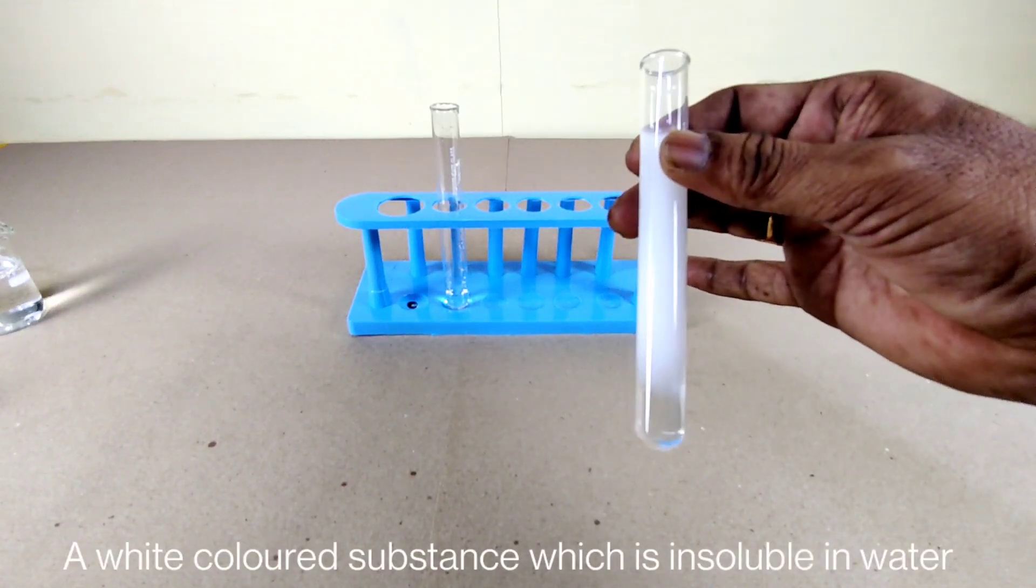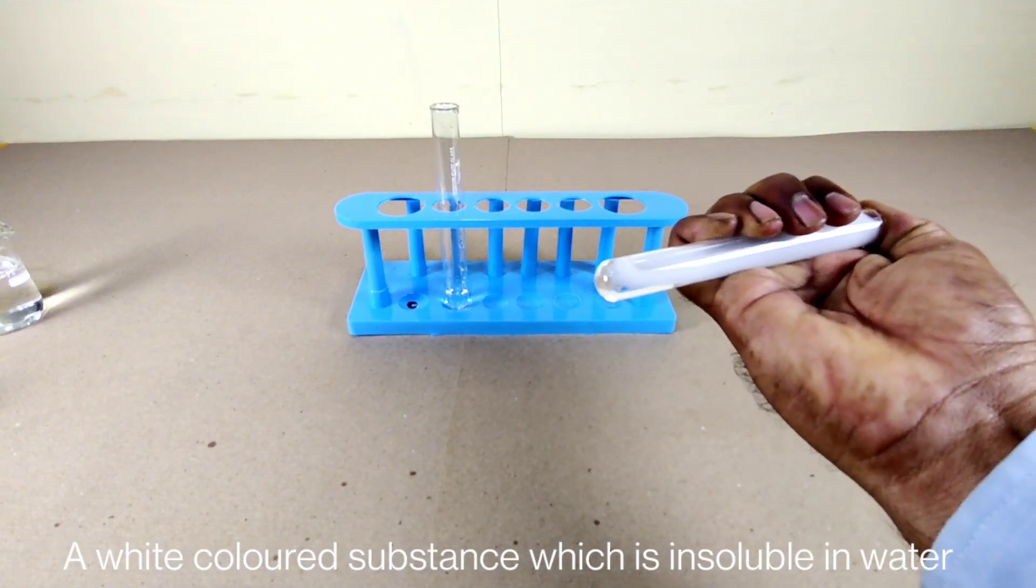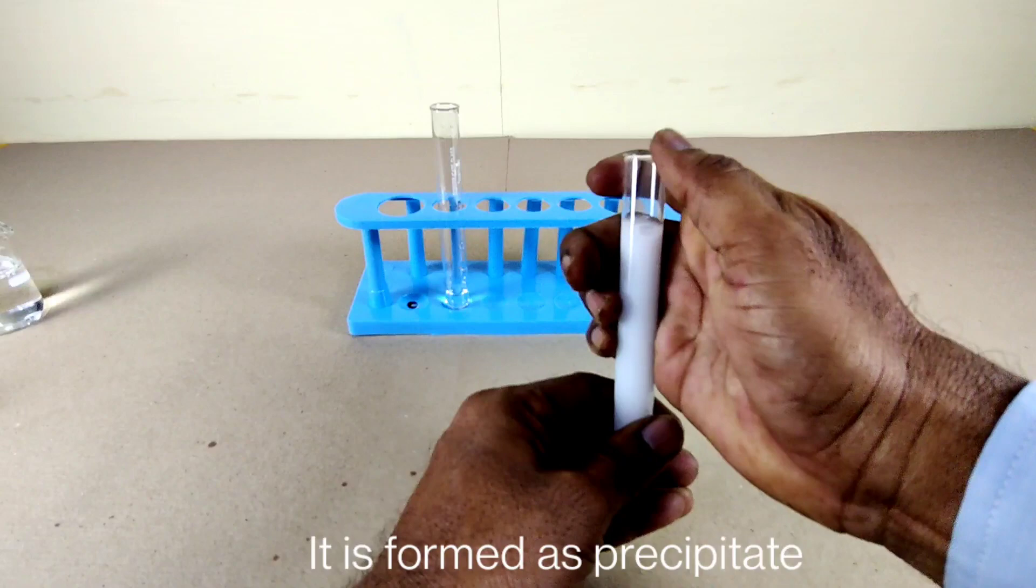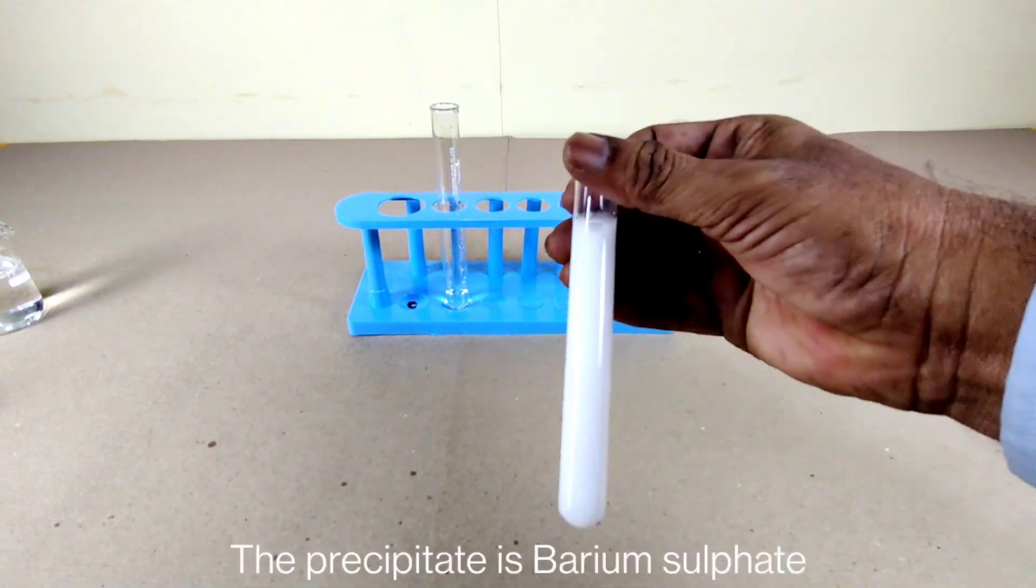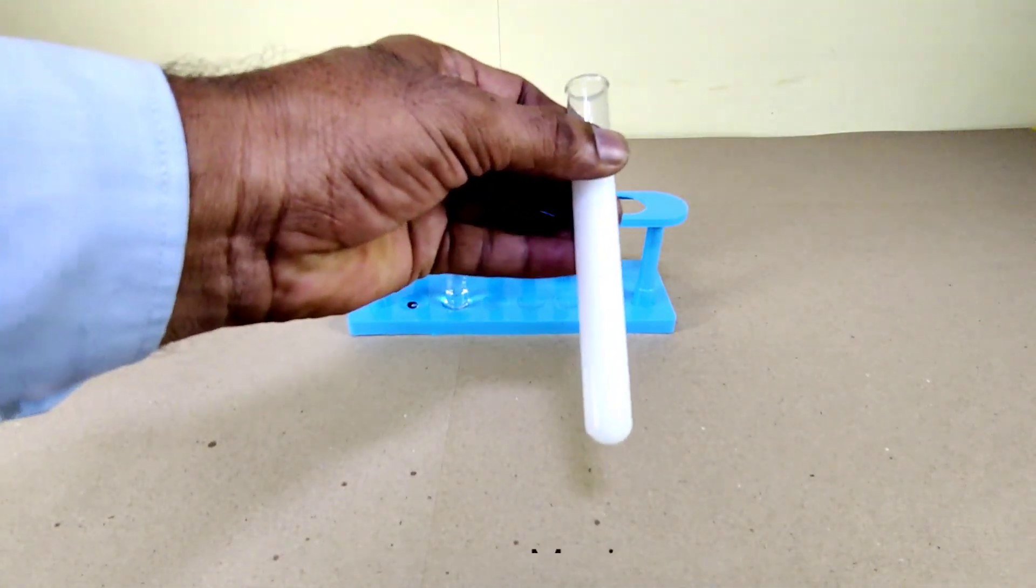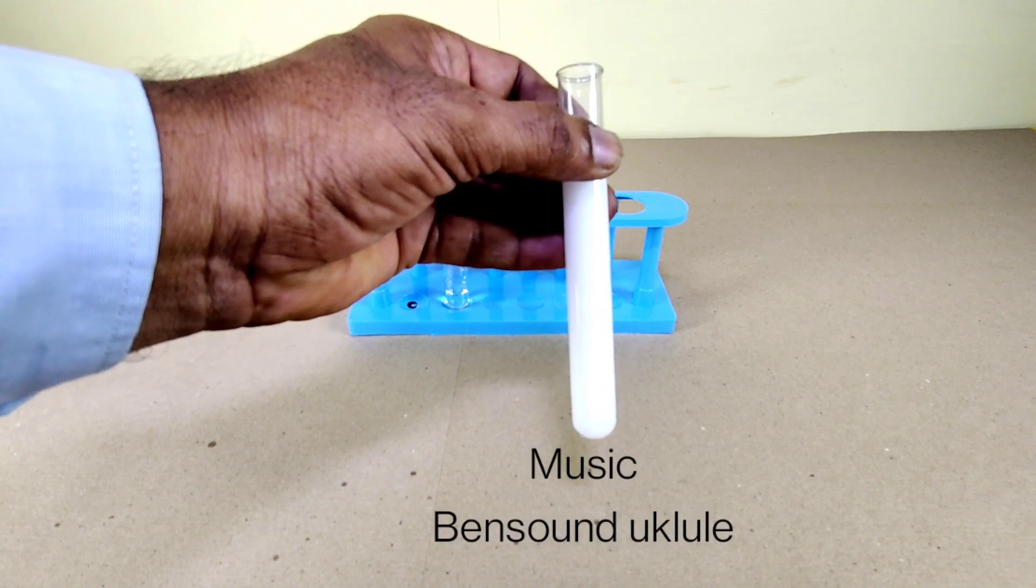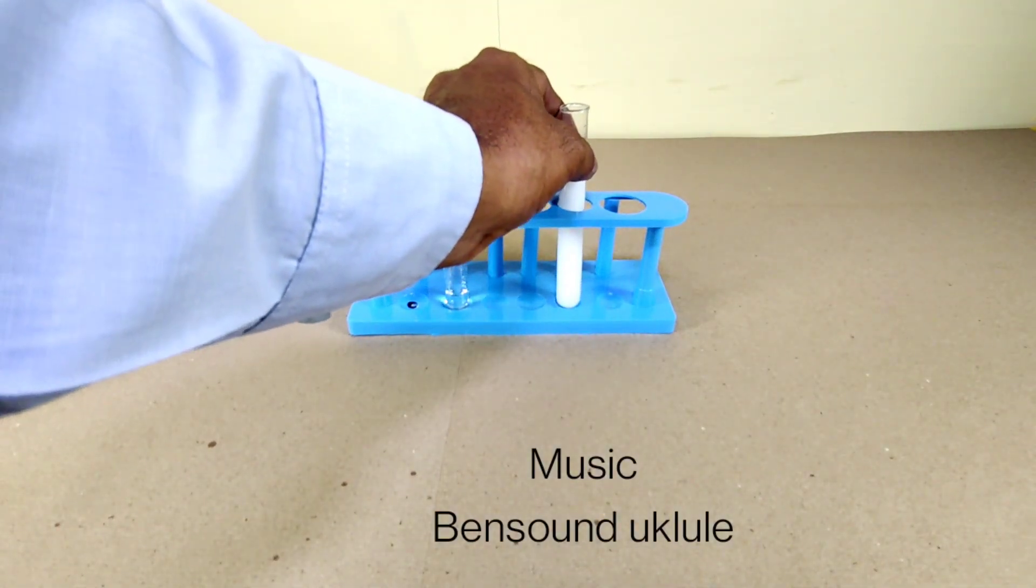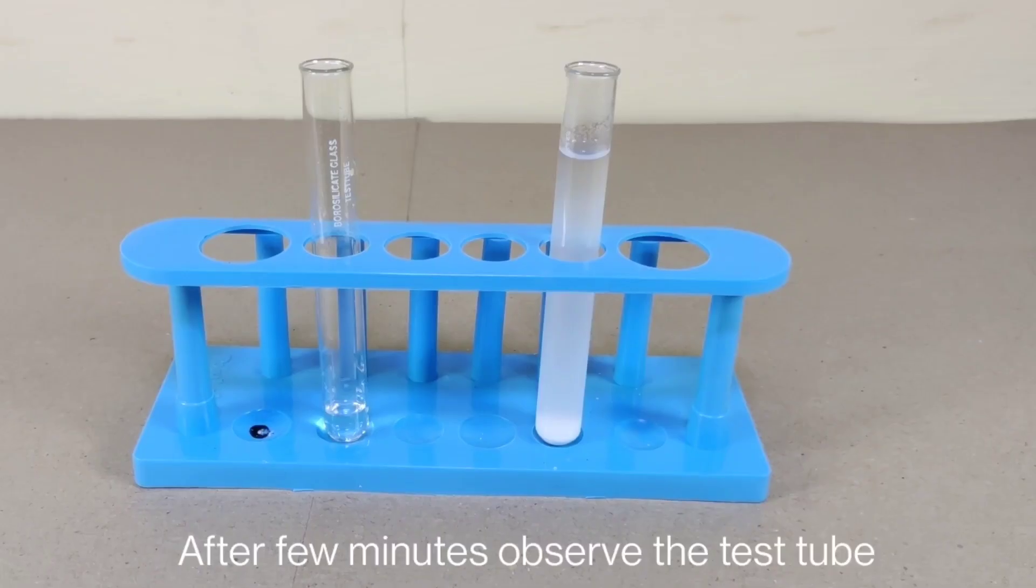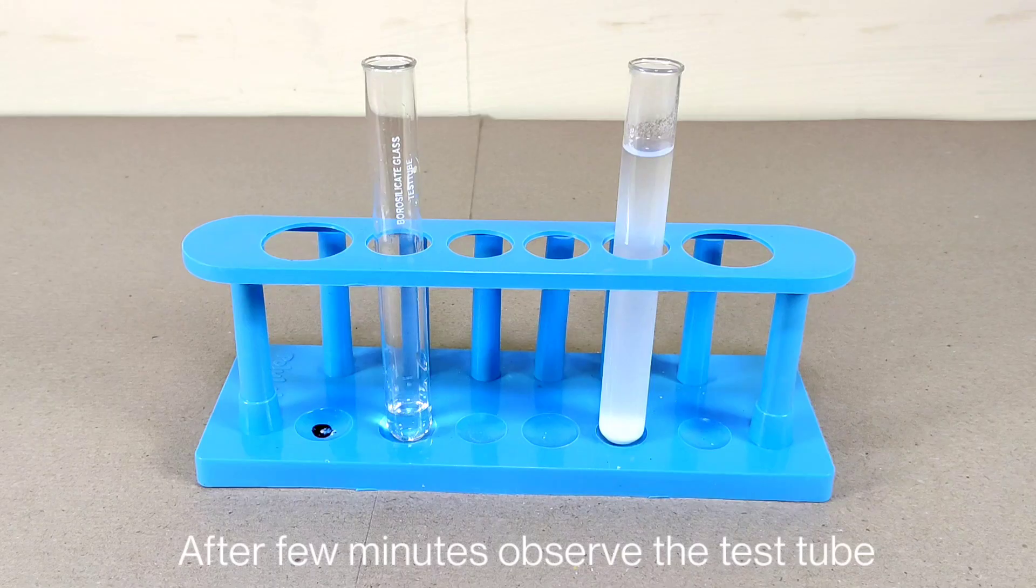A white colored substance which is insoluble in water is formed as a precipitate. The precipitate is barium sulfate.